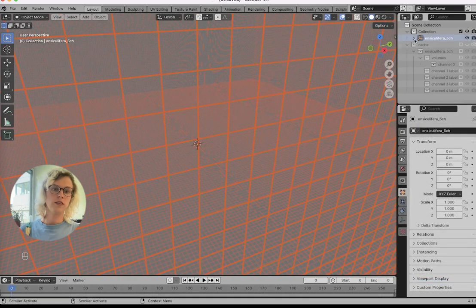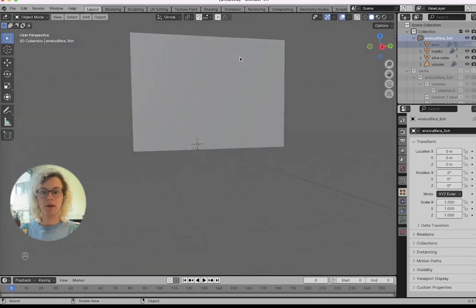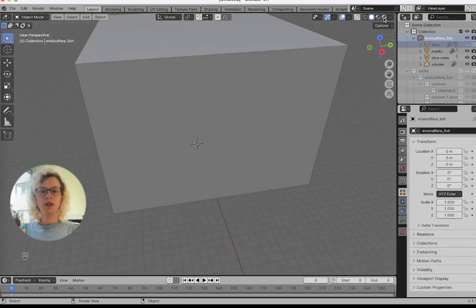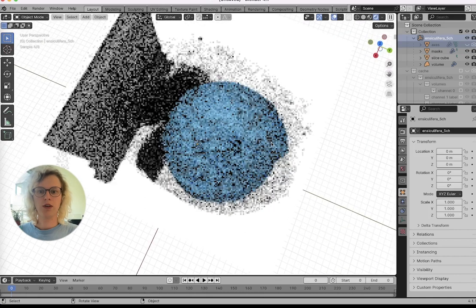Okay, so it's loaded. I will again first turn off the axes. This is usually quite useful for a lot of data types, so this is why they're usually included, but for the volume EM, it can be a bit heavy. And we can see our slicing cube, and inside it we see our data. This is very similar to how we had it last time. The only thing that's added is that we have masks now. So here we have our volume with our masks.